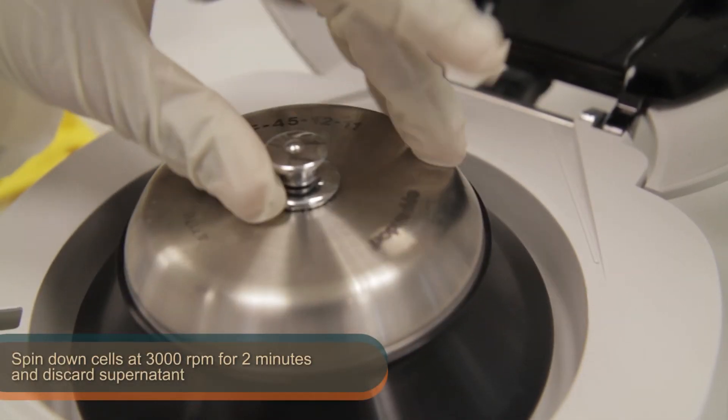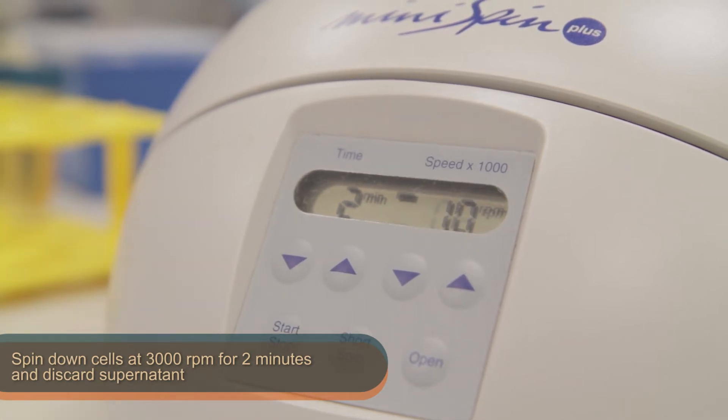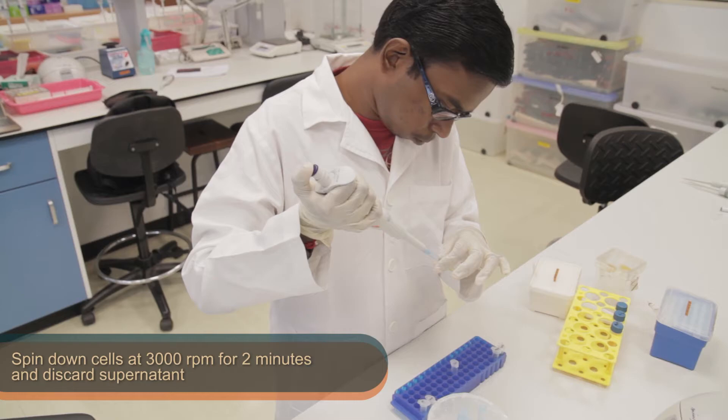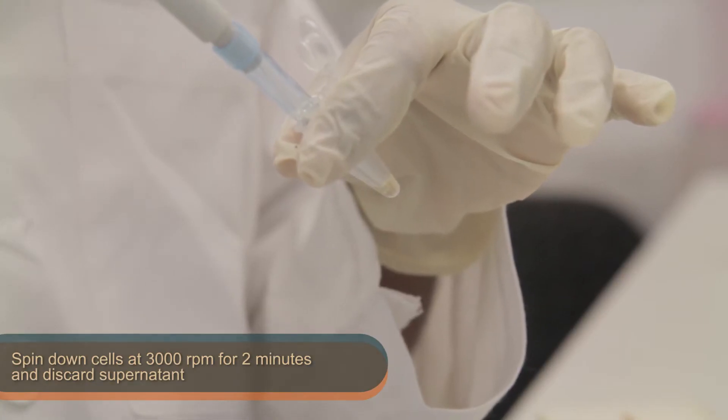Next, spin down the cells at 3000 rpm for 2 minutes and discard the supernatant. Make sure the centrifuge is balanced and be careful to leave the cell pellet intact.